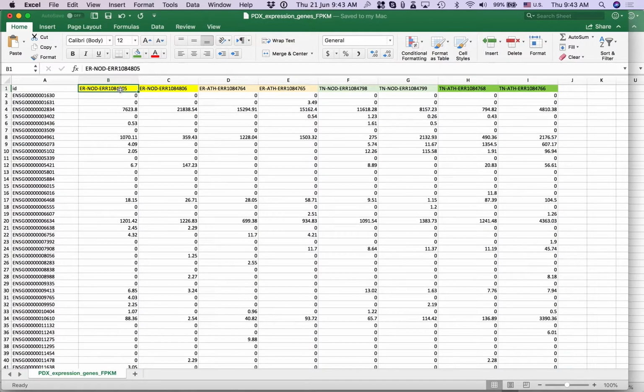And what I did was I deleted all the long names that we had with group 1 and group 2, because a long name is actually going to break the algorithm. It only reads so many characters. So we shortened the name, and now we have a clear indication over here for what the file name is and then what group it should belong to.